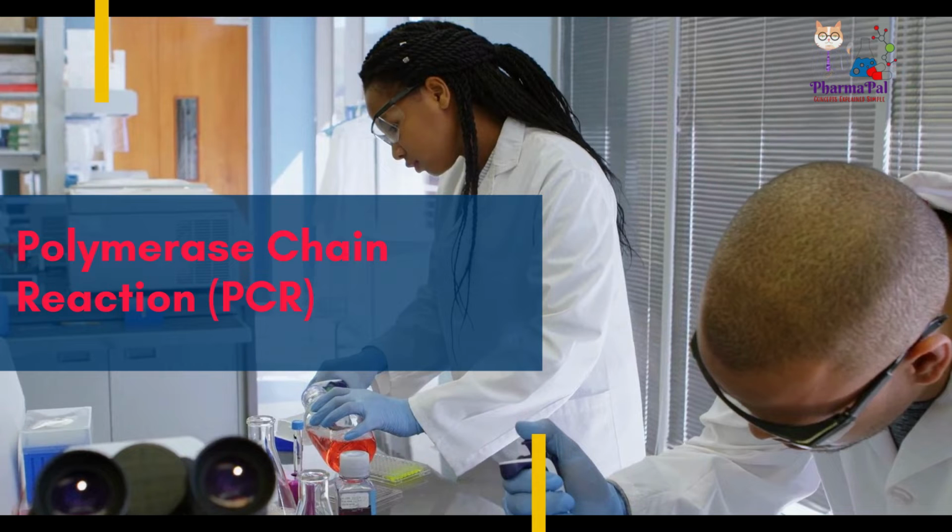It all began as a way to remove and use dNTPs from a sequencing reaction mix, but it quickly grew into a powerful technique for amplifying DNA. The methodology of PCR involves the amplification of DNA sequences using a DNA polymerase. By repeating a series of heating, cooling, and extension steps, the number of DNA copies exponentially increases.